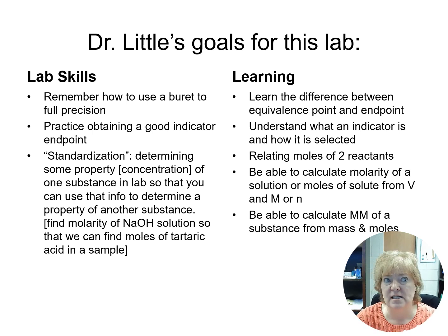There is a laboratory understanding of the difference between an equivalence point, which is a theoretical concept that we do in lecture, and an endpoint, which is a lab concept. Understanding what an indicator is and a little idea about how we select indicators. And then we're going into stoichiometry, relating moles of two different reactants, and also being able to do all the conversions associated with it.